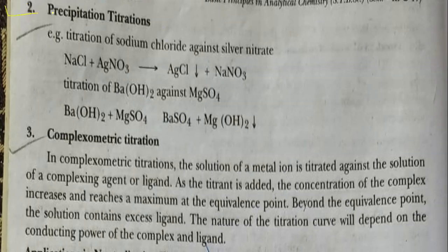Second is the precipitation titration. For example, titration of sodium chloride against silver nitrate, where there is a formation of AgCl and NaNO3. Again, titration of barium hydroxide against magnesium sulfate, where formation of barium sulfate and magnesium hydroxide takes place. This titration can also be studied with the help of conductometric titration.